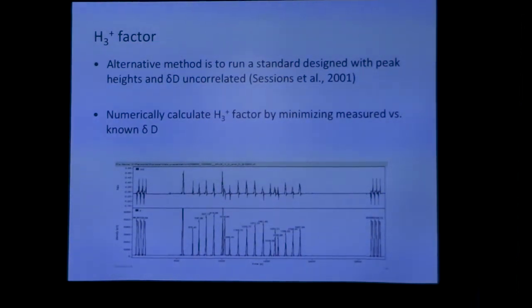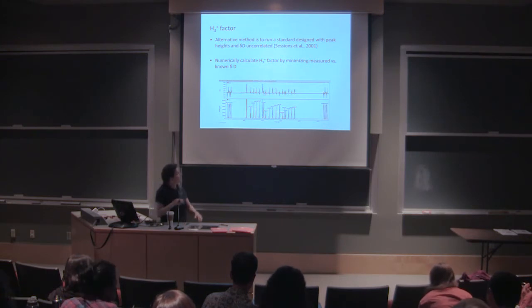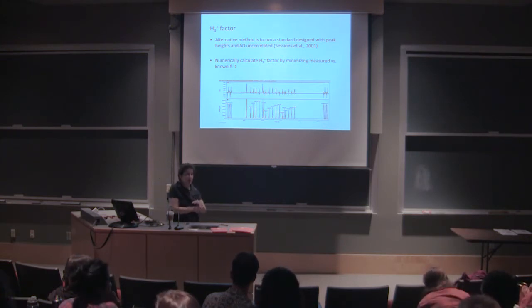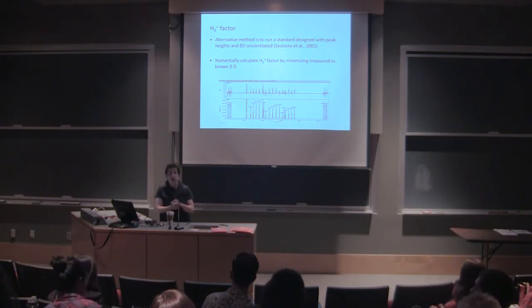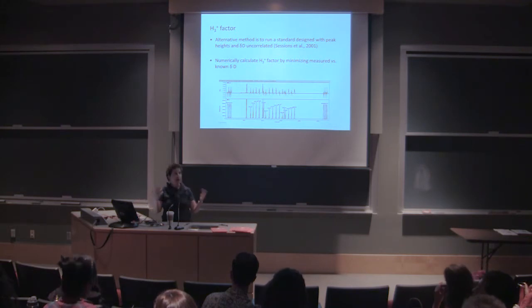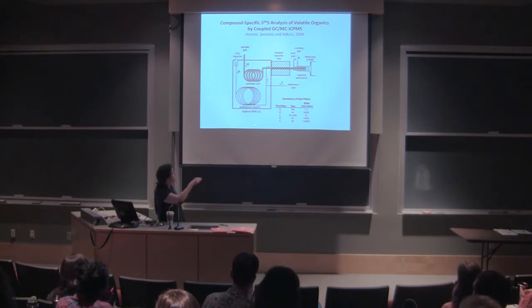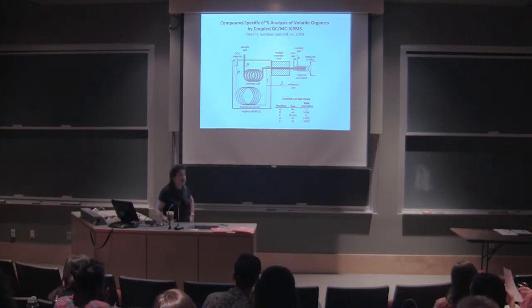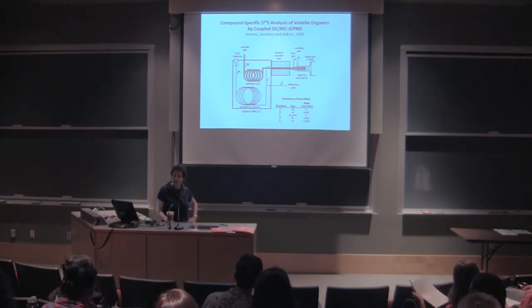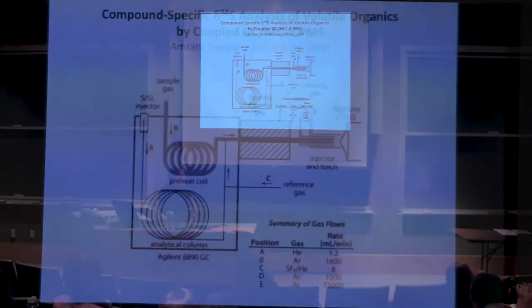Okay, well, let's pull our heads up out of the details here and talk about some of the other kinds of techniques that have emerged in recent years. I've shown you GC for carbon, GC for nitrogen, and GC for hydrogen on organic compounds. What I haven't shown you is sulfur, and that in recent years has been made possible by taking a GC, literally wheeling it up and sticking the end of it into a Neptune ICP, inductively coupled plasma ion source mass spectrometer, and then the sulfur is measured for individual peaks coming off of that.